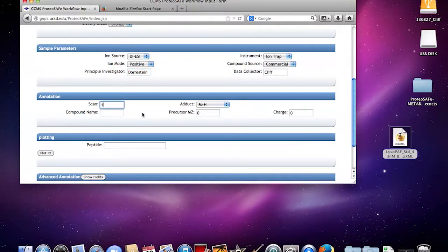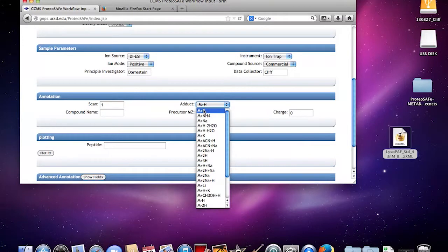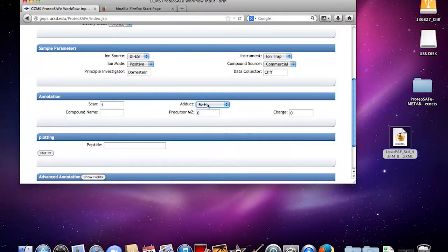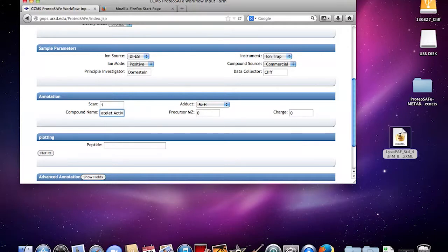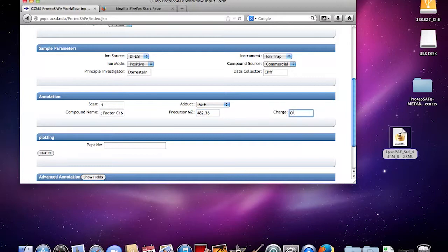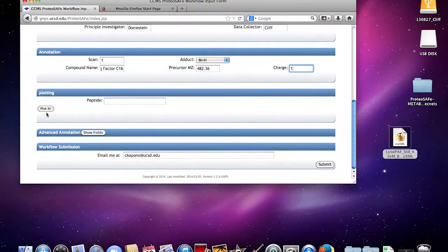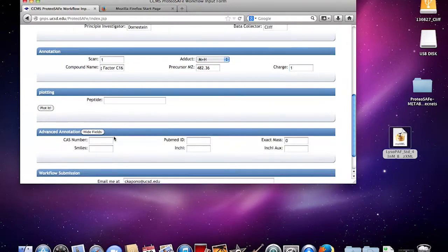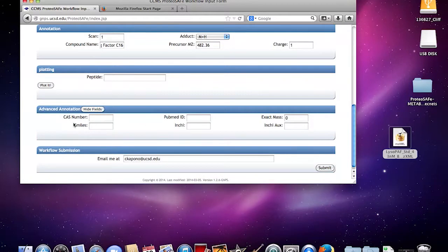I'm doing the first scan for this with your adduct, compound name, precursor and charge.